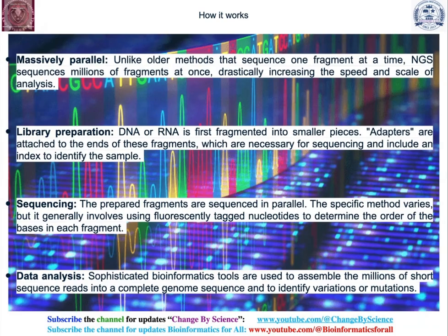Now it comes to the data analysis. Before you enter into analysis, you need to remove all the adapters which you have added during the library preparation, then it is really good analysis. Sophisticated bioinformatics tools are also available, but you can also work on your own approach and design modules to assemble the millions of short sequence reads into a complete genome sequence, and to identify the variations or mutations, differential gene expression profiling, or also the epigenetics, for example, transcription factor binding site enrichment or methylation profiling.